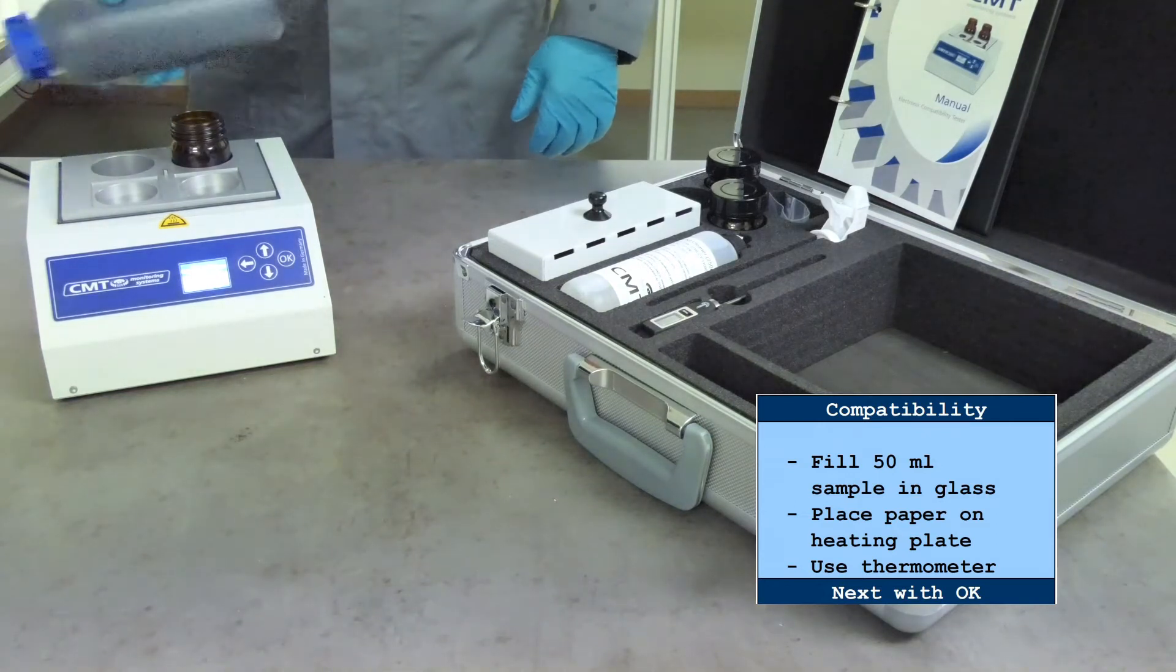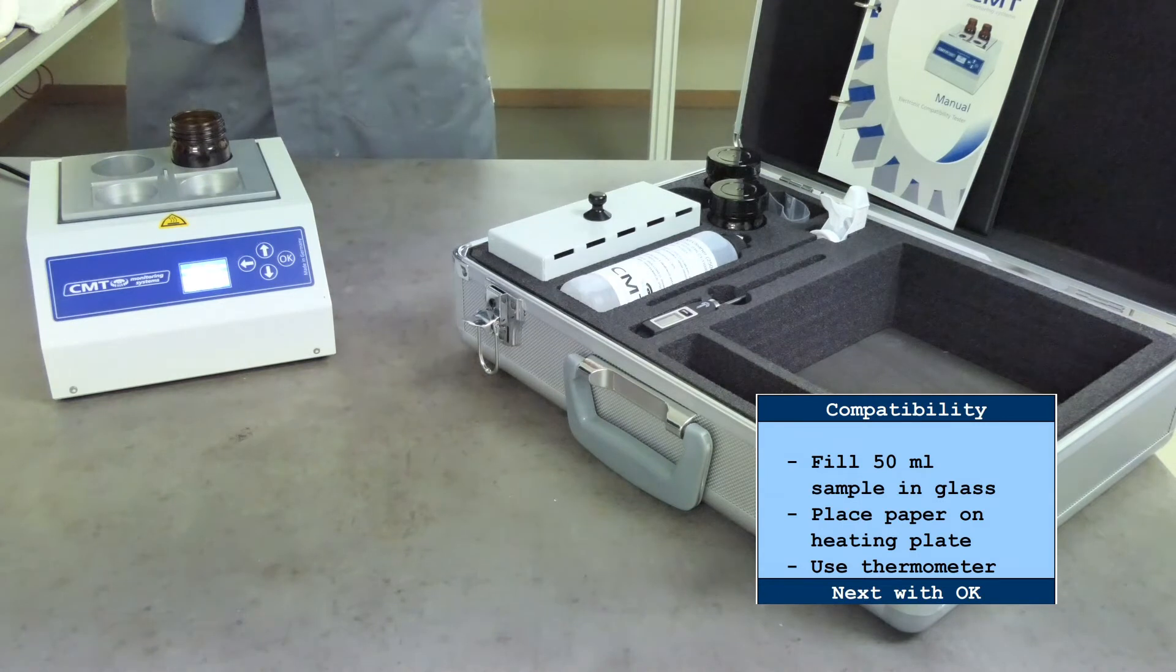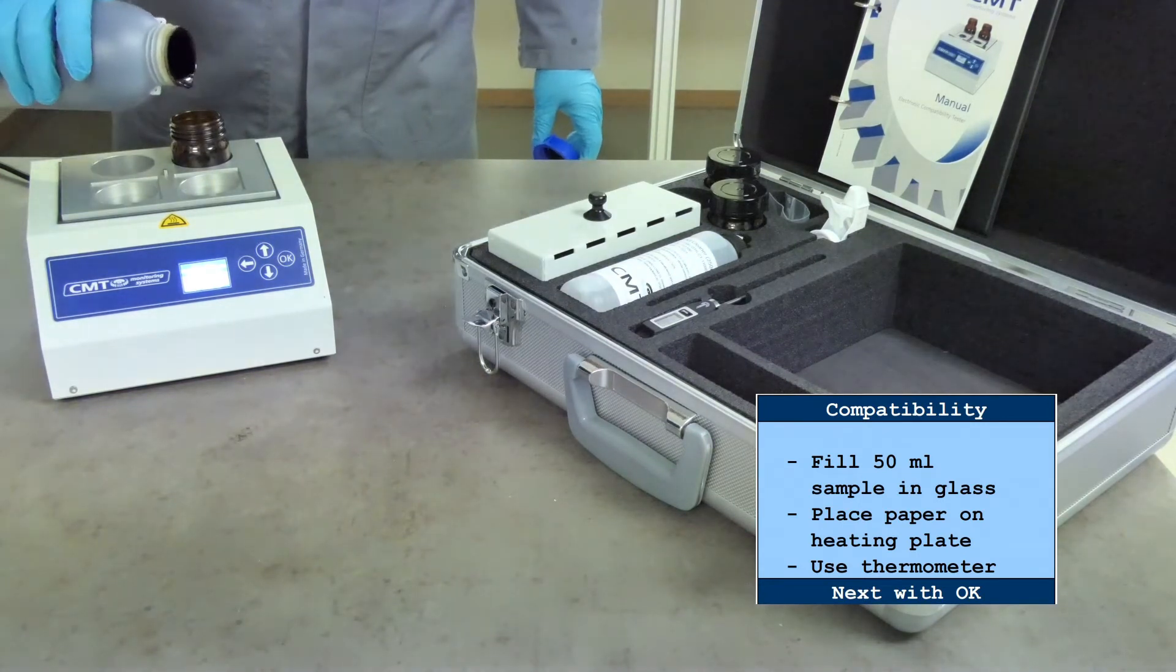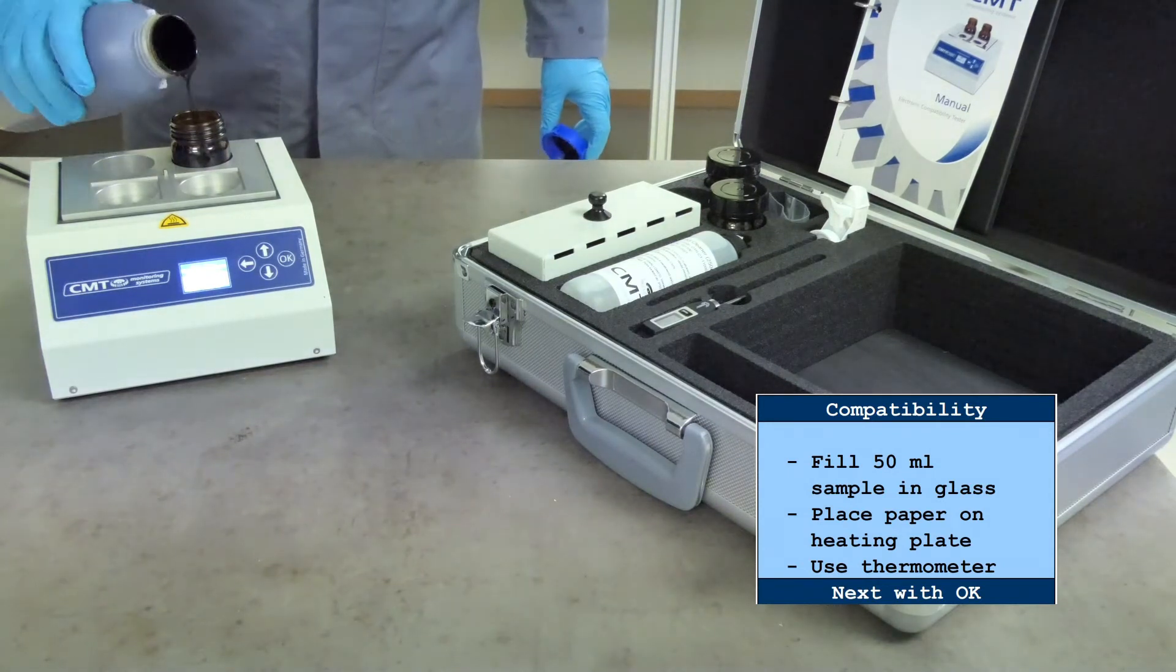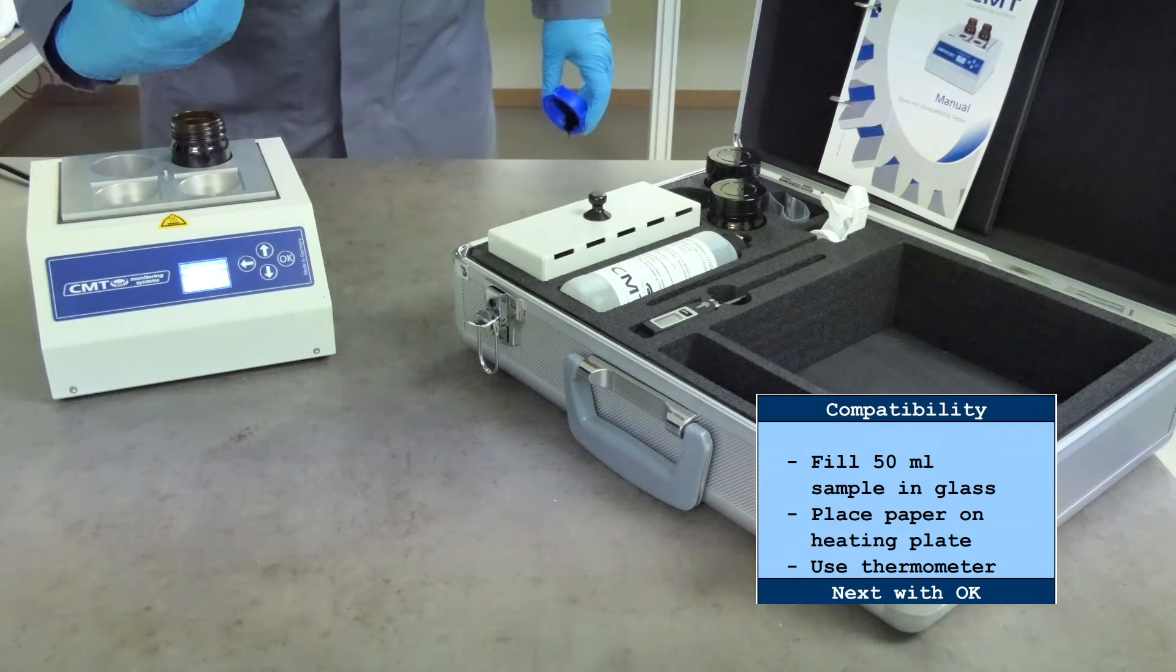If in actual practice, an application requires a blend ratio other than equal parts, conduct the test using the actual blend ratio for the test result to have a good probability of being indicative of the final blend.